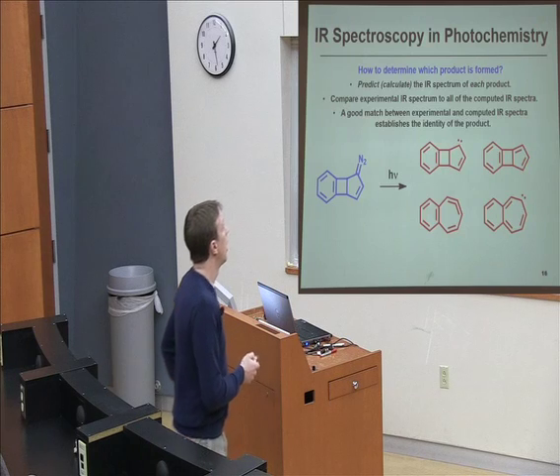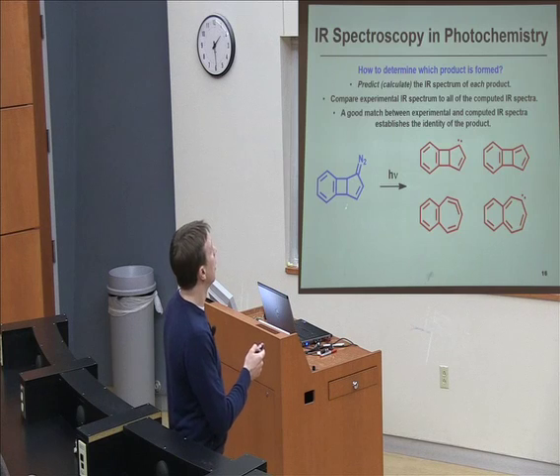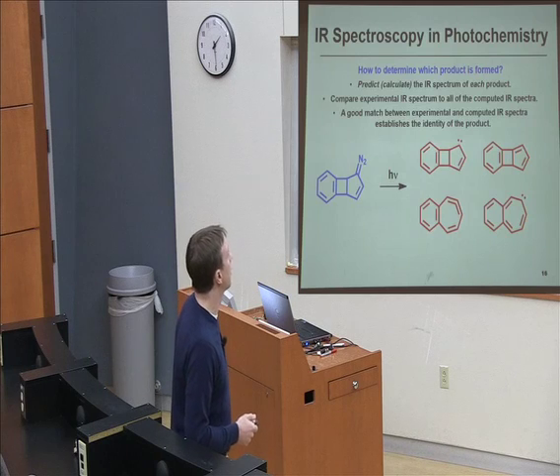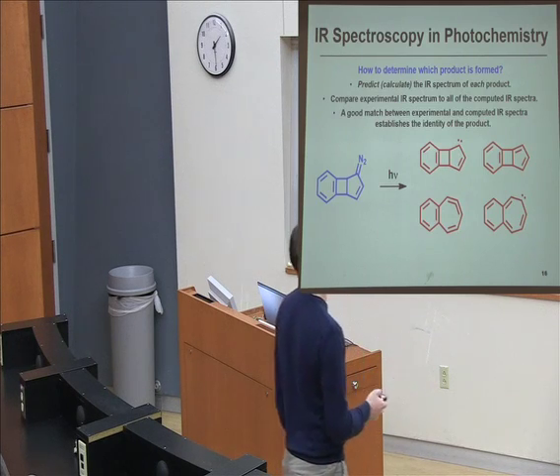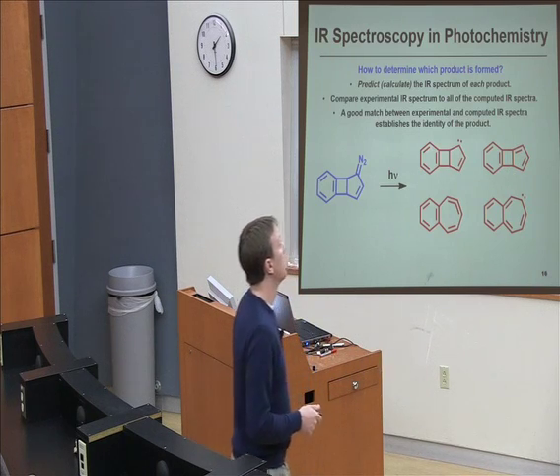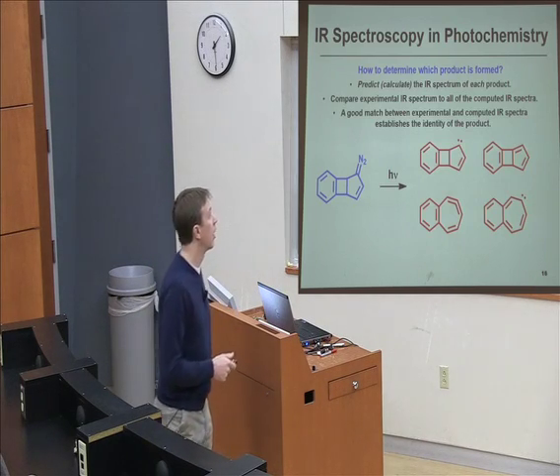In addition, all of these carbons are going to be fairly similar in chemical shift, except these two in the reactant, which are sp3 hybridized. And depending on which product is formed, possibly one or fewer of the carbons in the product are sp3 hybridized.